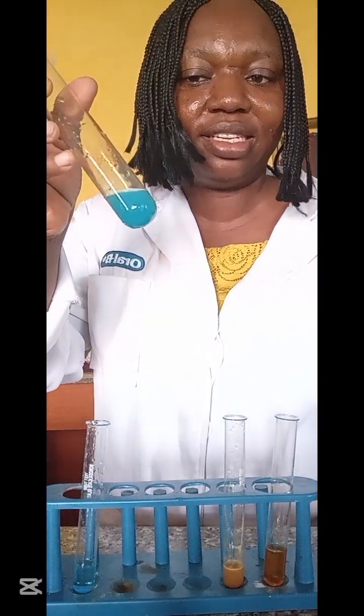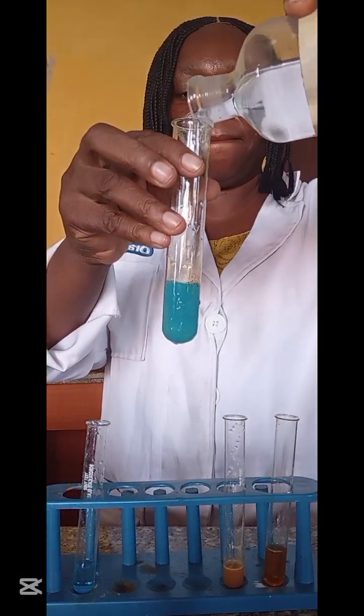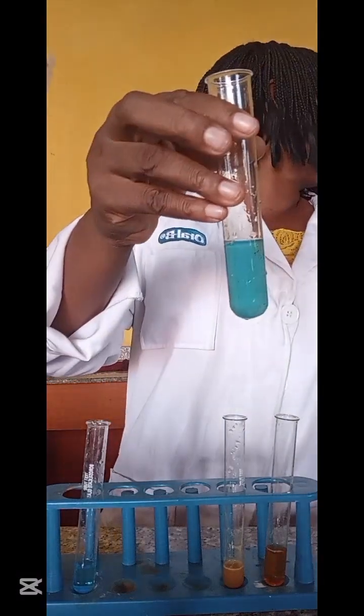Sodium hydroxide, blue gelatinous precipitate.